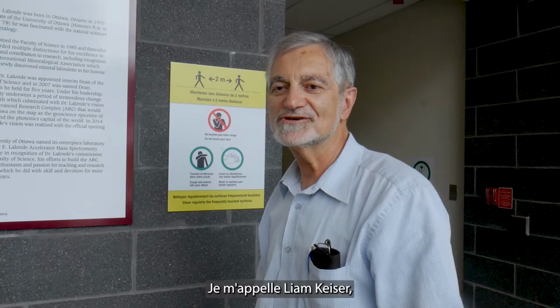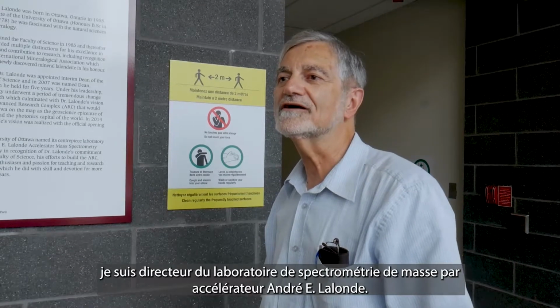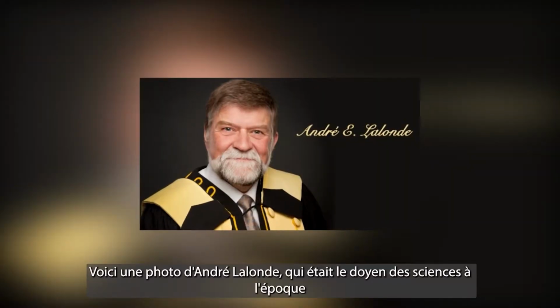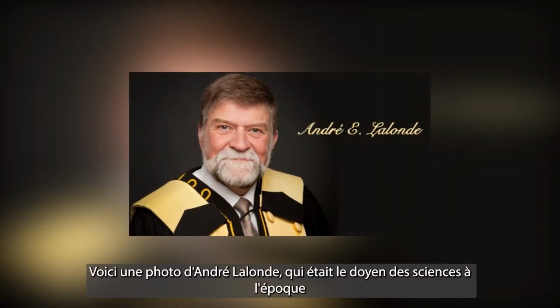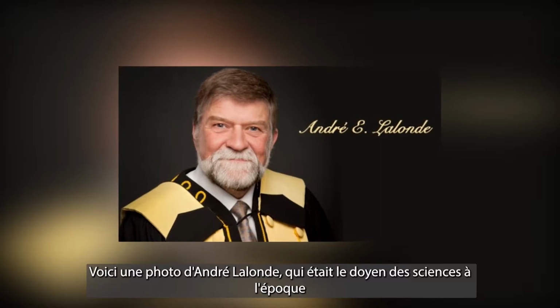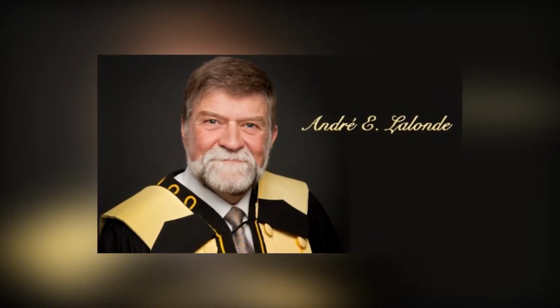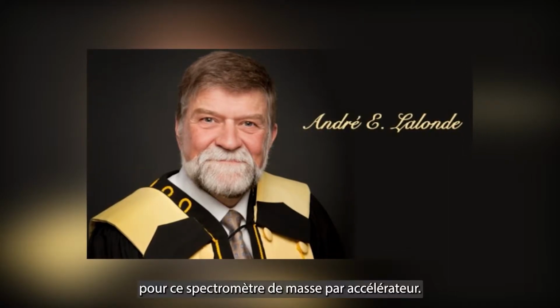My name is Liam Kieser. I'm the director of the Andre E. Lalonde Accelerator Mass Spectrometry Lab. Here is a picture of Andre Lalonde, who was the Dean of Science at the time when the funding came through from the Canada Foundation for Innovation for this accelerator mass spectrometer.